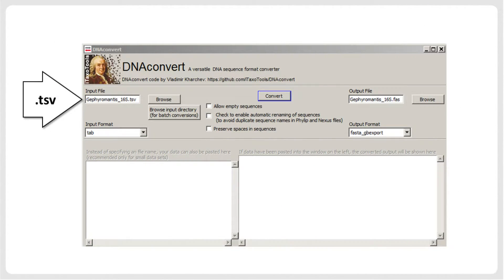The next step is to use dnaconvert, a small converter program developed in the itaxoTools project, to transform the TSV file into a FASTA file. For this, specify tab for the input file, and FASTA underscore gbexport for the output file.